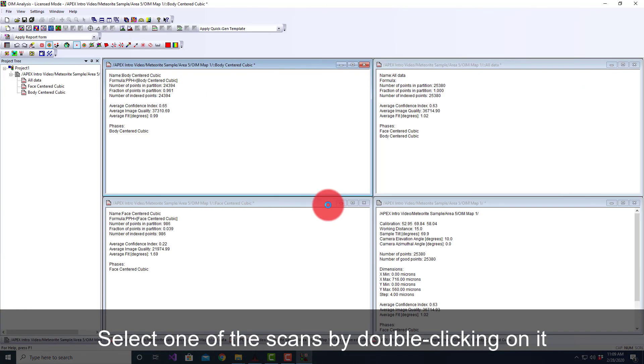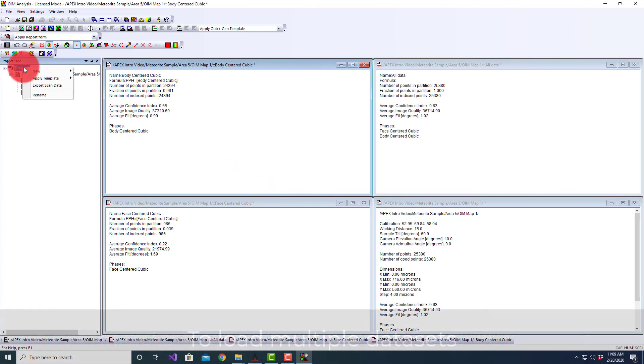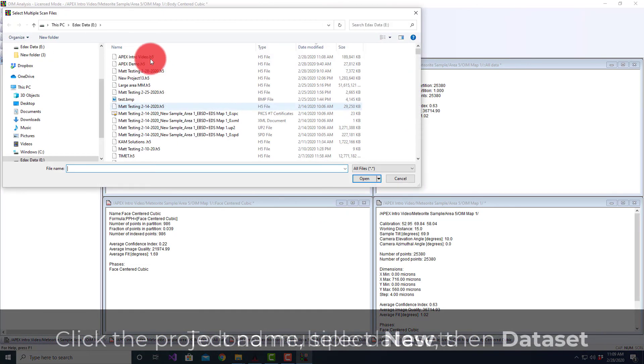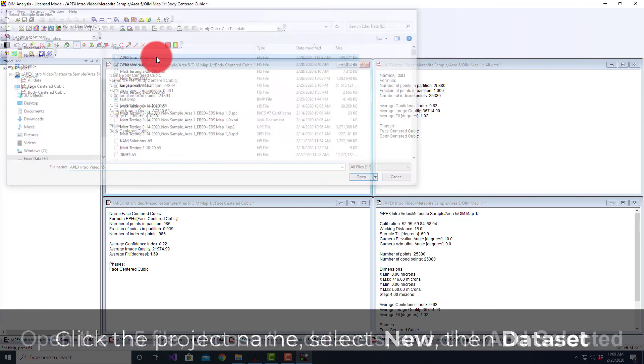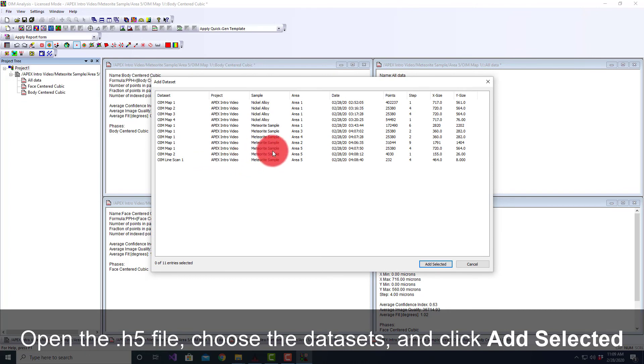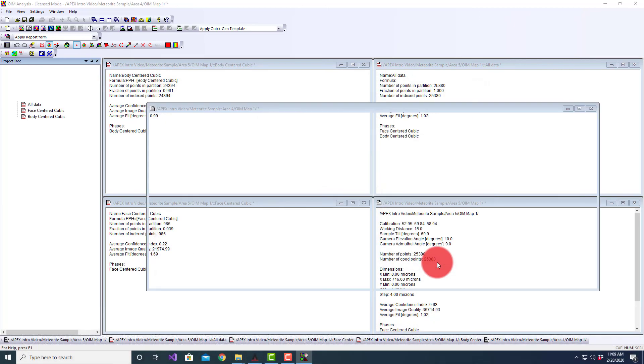I also have the option if I wanted to load multiple ones at the same time. I could load my project. It shows me here basically as a function of time the different ones. So I can say I wanted to load this one and this one and this one, and I can add those.